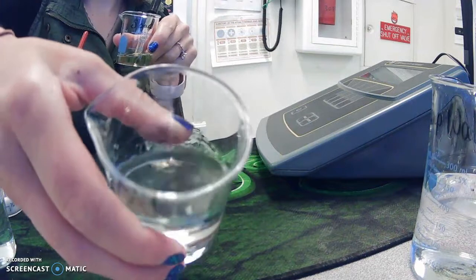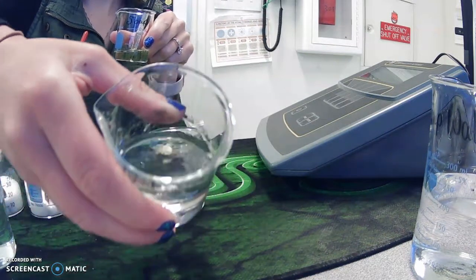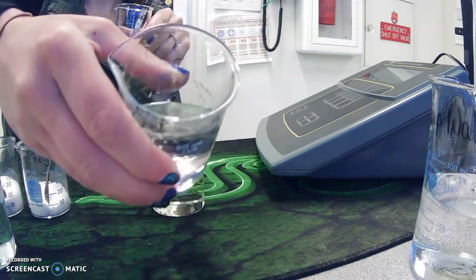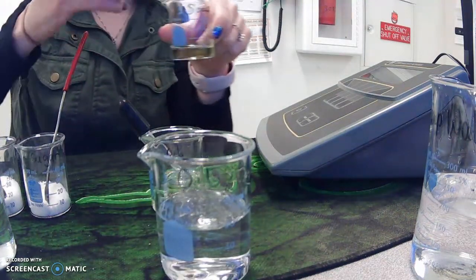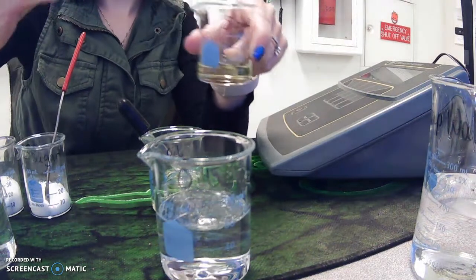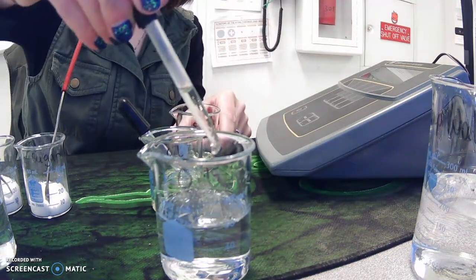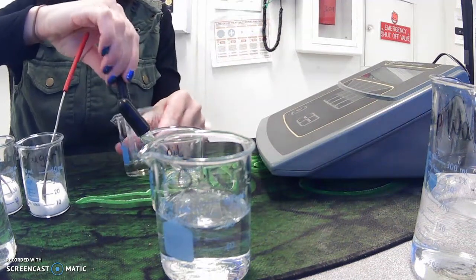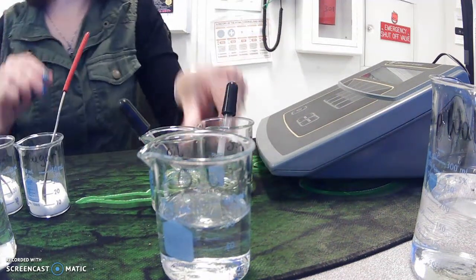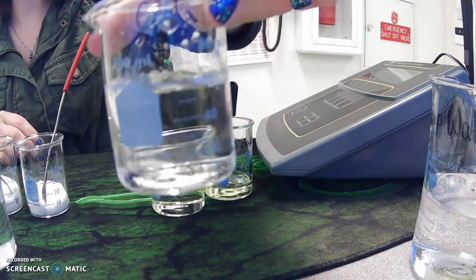Look at it before we add our soap. There's still the droplets at the top. So as we start to add our soap, and the soap is kind of a yellow color too, we'll see what is going to happen to our oil mixture.